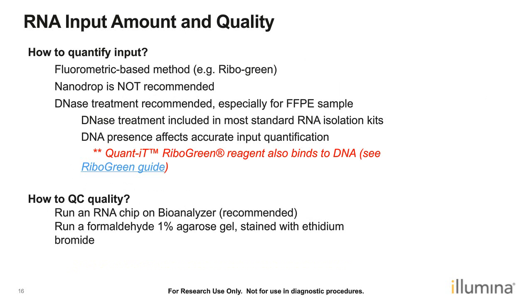When dealing with RNA input amount, there are going to be different input requirements for our different kits. As I mentioned previously, if using TruSeq RNA V2, stranded mRNA, or stranded total RNA, you can use your total RNA. We also have the option of using previously purified RNA. So if you have a method of purifying your RNA that you're comfortable with, you can use purified material for stranded total kits.